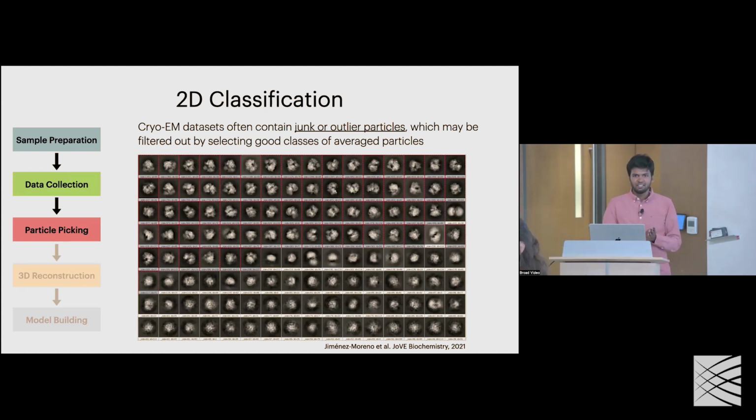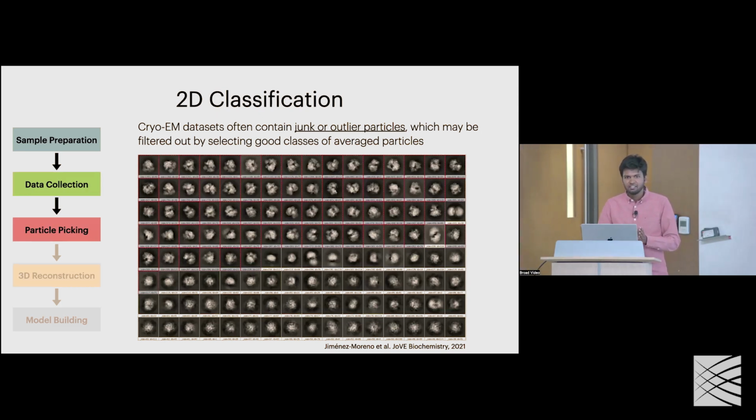Can I ask you a quick question about the electron micrograph? I know cryo-EM took off a lot in the last maybe 10 or 15 years. And I heard one of the reasons was that imaging got better, or the cameras got better. Is that correct, or am I imagining that?